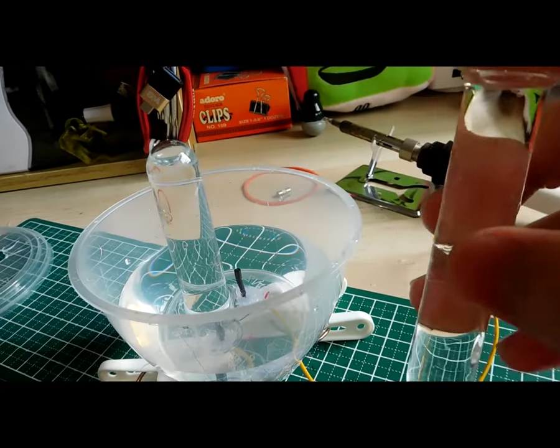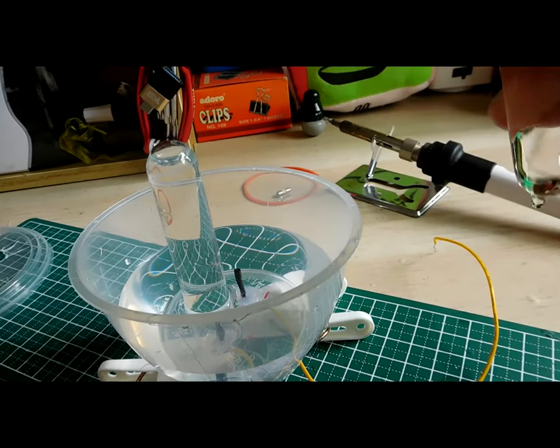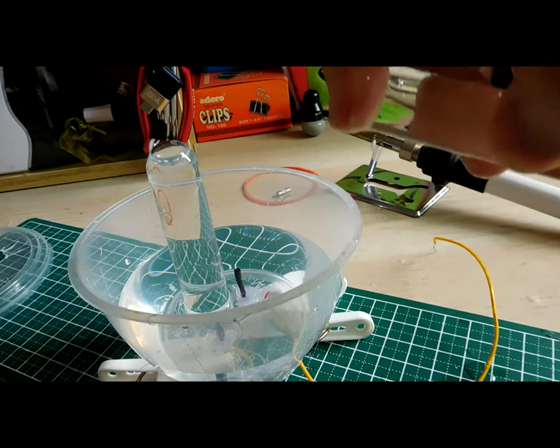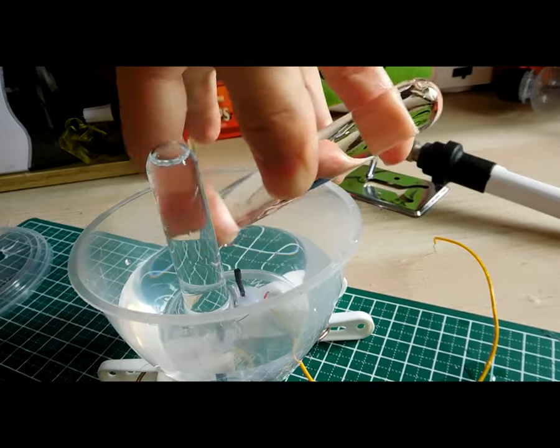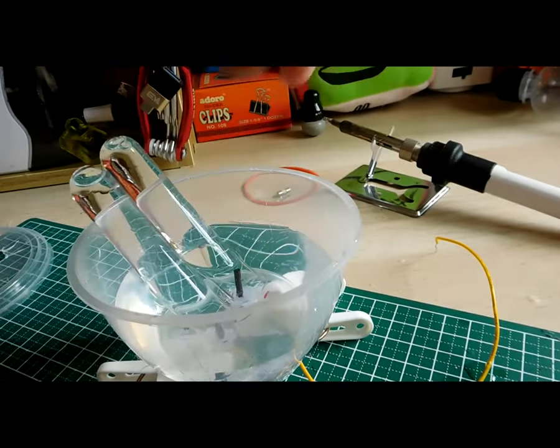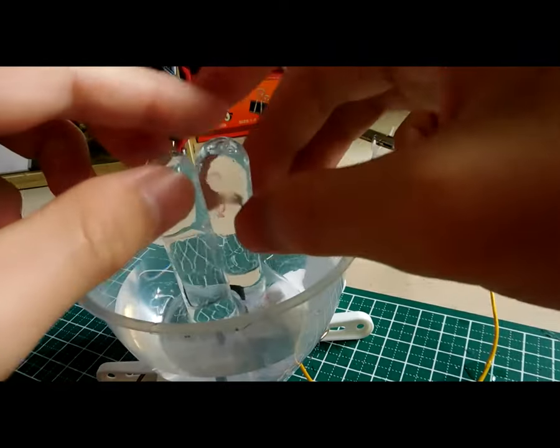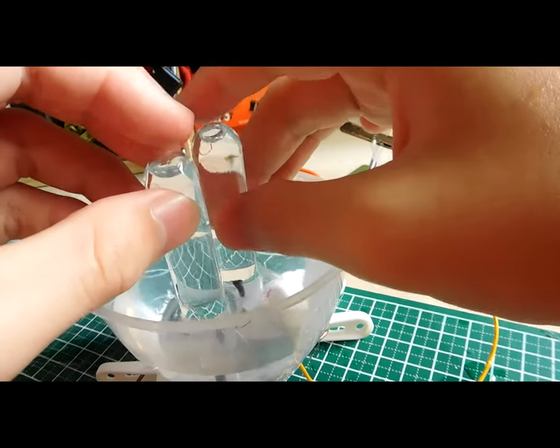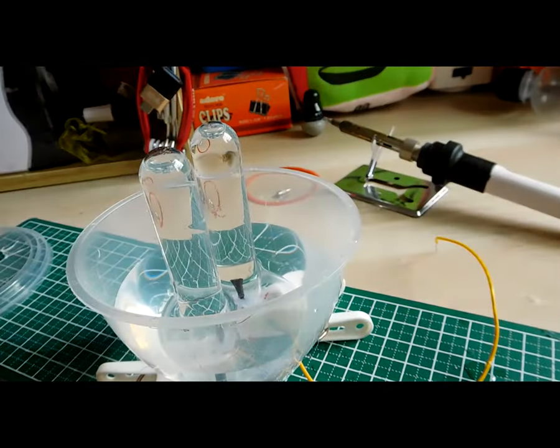What you have to do is cover the mouth of the test tube with your index finger, invert the test tube, and place it inside the water with the mouth fully submerged before you let go of your index finger. Once that's done, you can see that the water is trapped in the test tube.